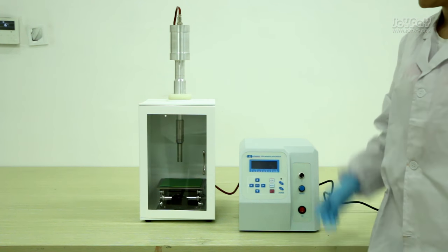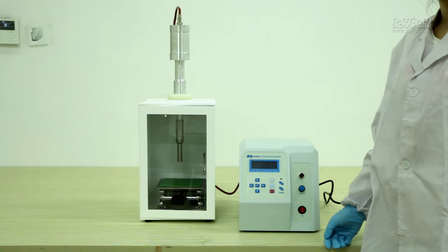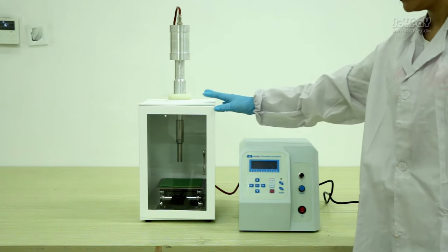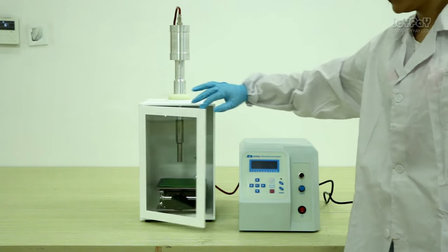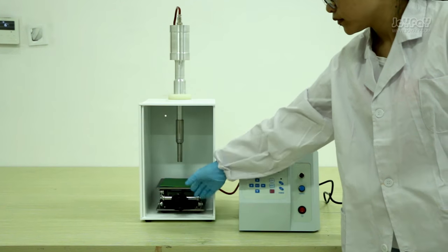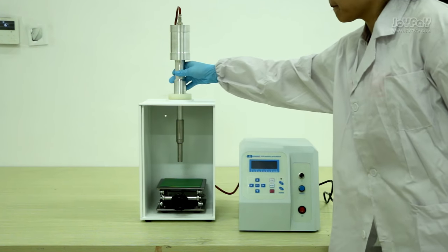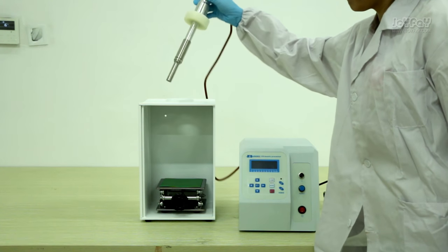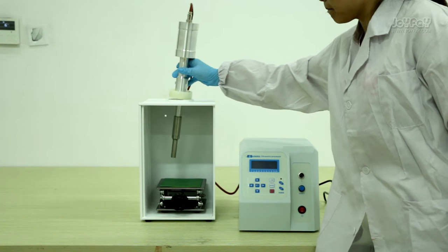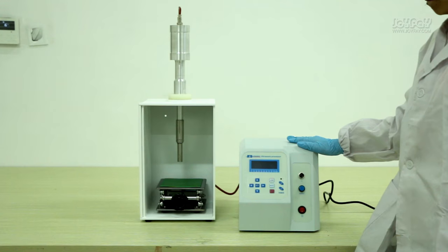To save time, we connected each part in advance. Let me introduce the components for you. The white box is a soundproof box. The item inside is a lifting platform. Here is the ultrasonic probe, which is the most important part. And here is the generator of the machine.